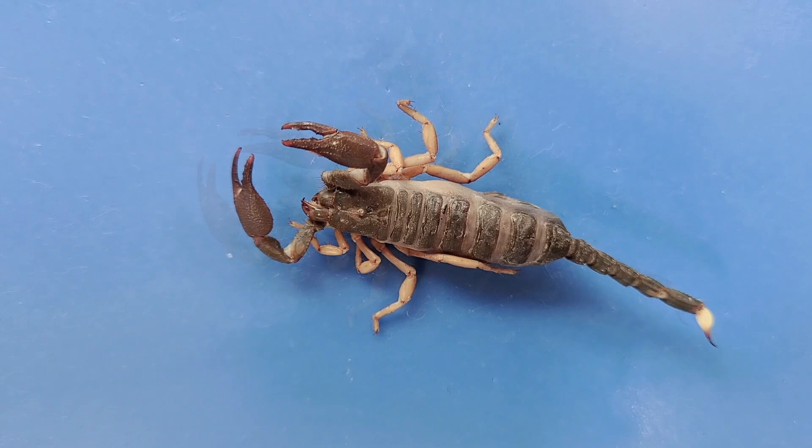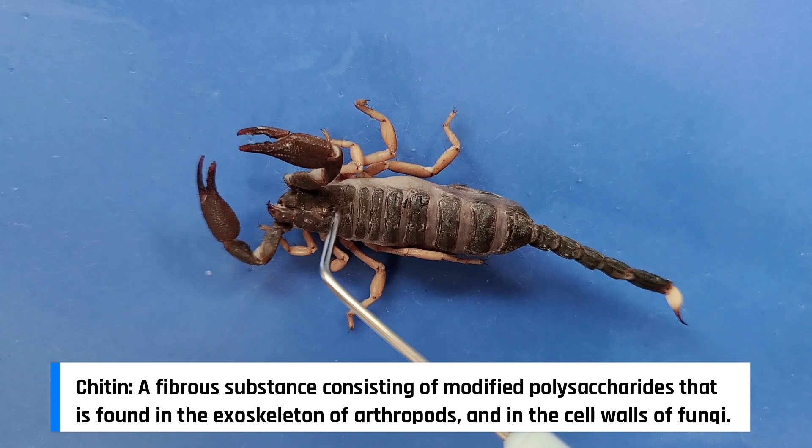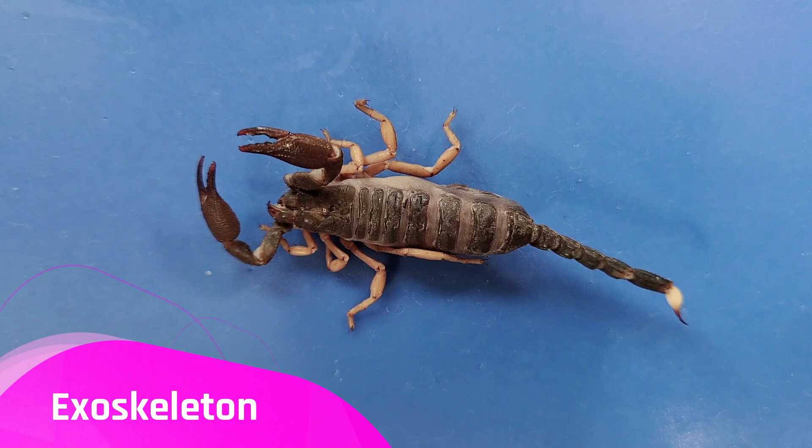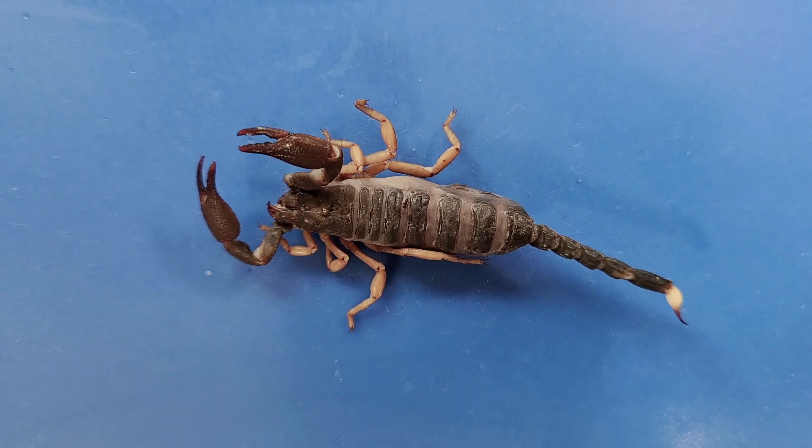So let's take a look at the external anatomy. The body of the scorpion is covered by a chitin exoskeleton. Chitin is a tough, protective, flexible molecule made of polysaccharides and nitrogen. The scorpion's exoskeleton acts like our skeleton by providing support, muscle attachment sites, and so on.